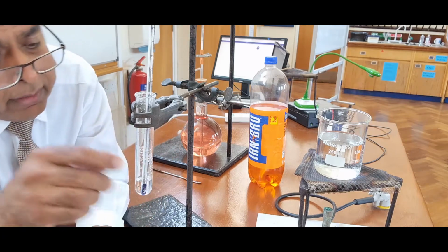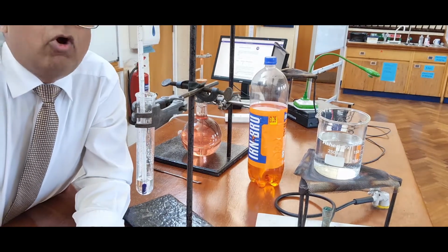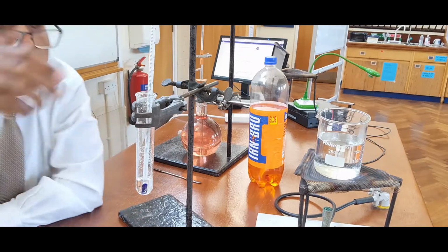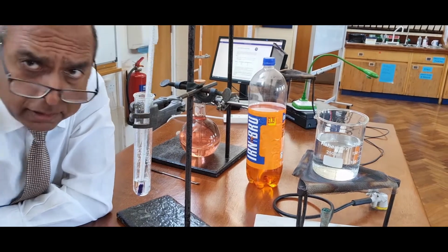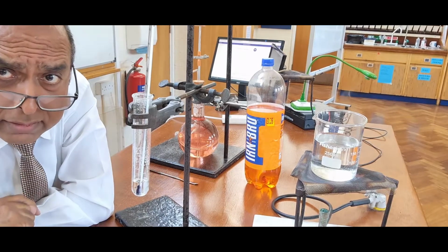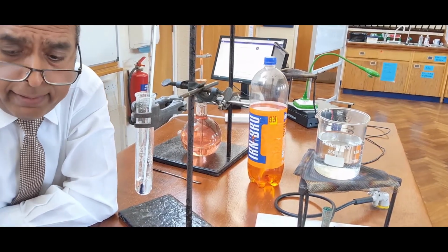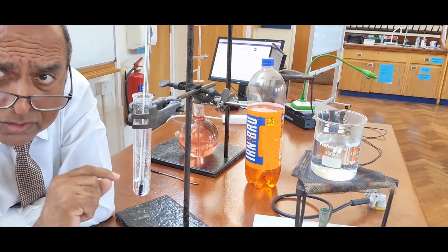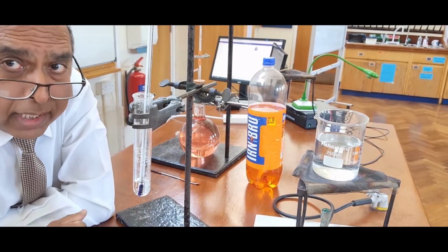At some temperature, we're going to see crystals. And that's the temperature I'm hoping to record: the temperature at which we get crystals. And when they start to form, hopefully I will be able to show you the crystals. So I'm just going to keep an eye on that while I talk about another idea, and we'll wait for the crystals to form. Believe it or not, this waiting for crystals to form is called crystallization.